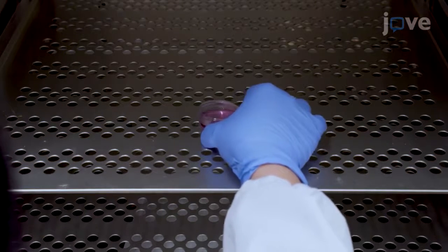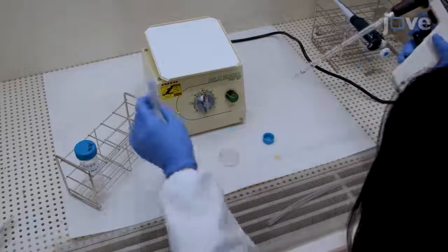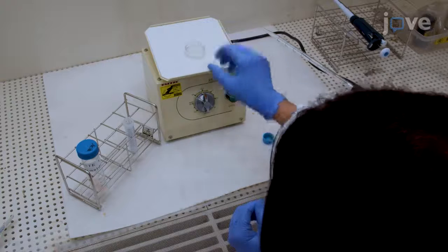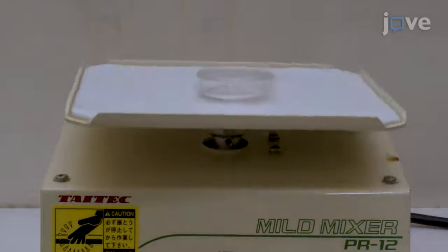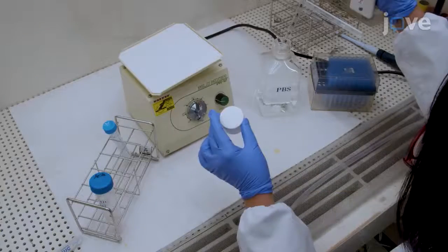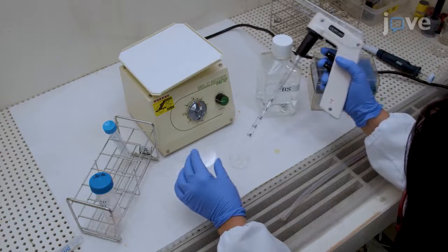After 24 hours of incubation, replace the medium with 2 milliliters of 3.7% formaldehyde in PBS and mix gently. Fix the cells for 15 minutes at room temperature on a rotating platform. Wash the cells 3 times with 2 milliliters of PBS for 5 to 10 minutes.